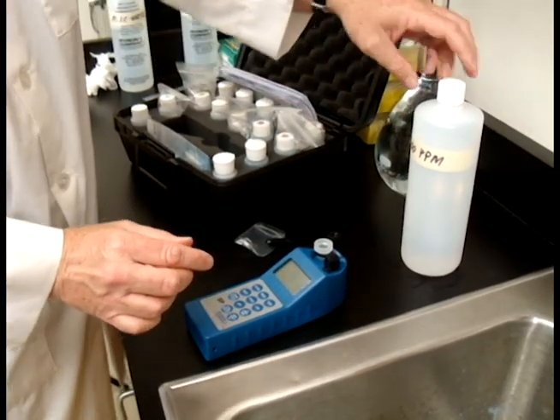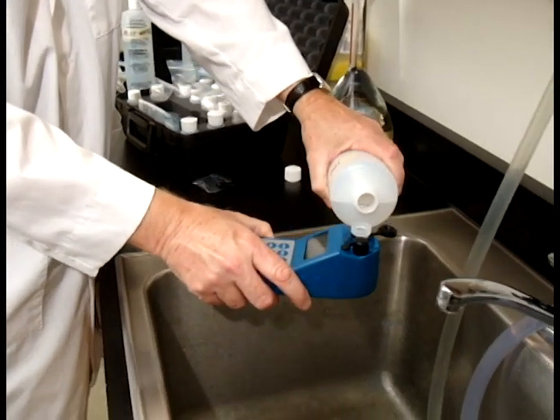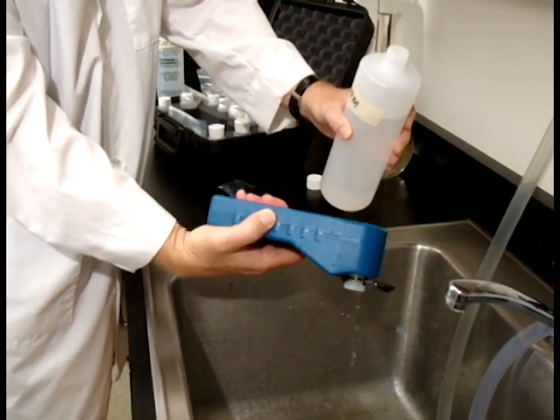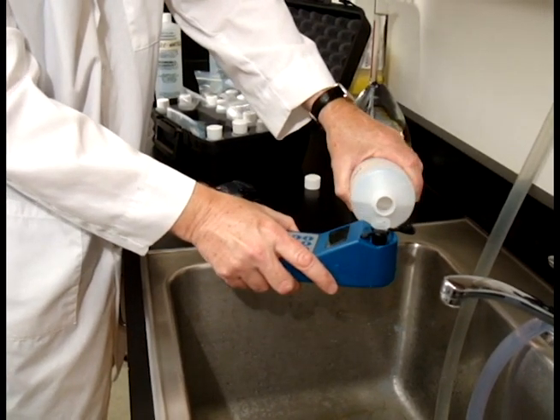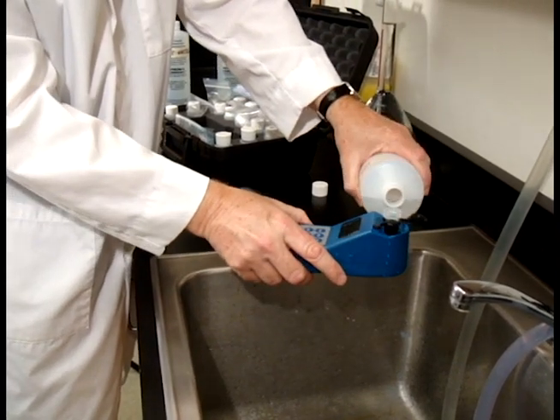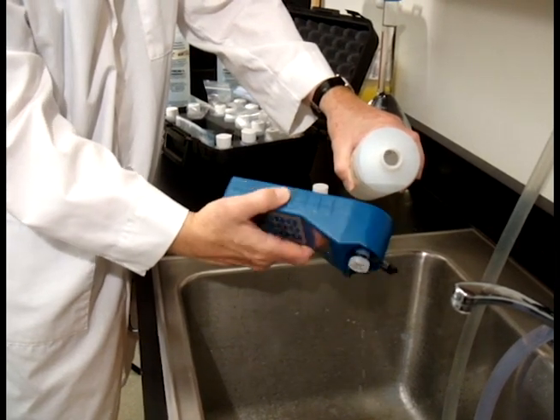But before we get started on that, we have to rinse our cell cup three times with the solution we're going to be using. I'm just using 100 ppm solution. That's two. I always like to get the cap to make sure it's rinsed also.